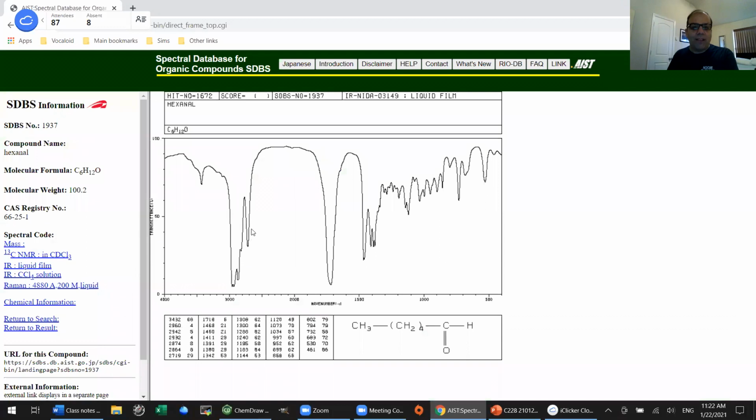And there we go. And lo and behold, this peak down here, it's usually significantly below 3,000. That one there, I believe, will be the CH stretch. And you can, actually, it might even tell us, does it? No, it seems that it doesn't. Well, that's lazy of them. So you'll notice that's significantly separated from the CH stretches here just below 3,000. So that's what I look for in terms of telling an aldehyde apart from a ketone. It's interesting that the carbonyl stretch is so much broader. I don't know that that will always be the case, but certainly the aldehyde CH stretch stands apart from the regular sp3 hybridized CH stretches.